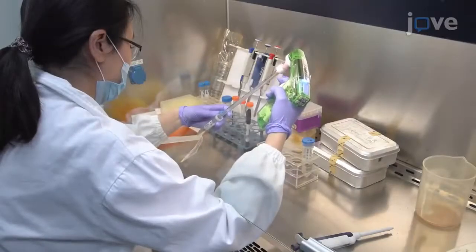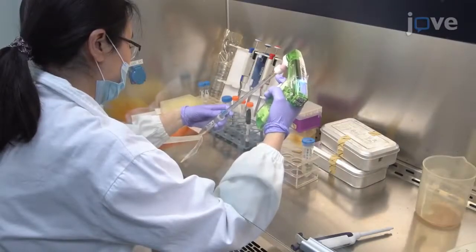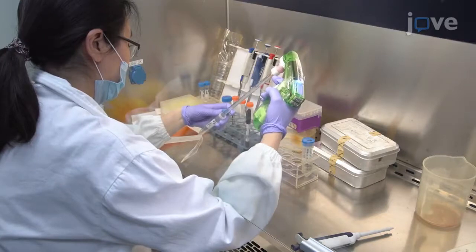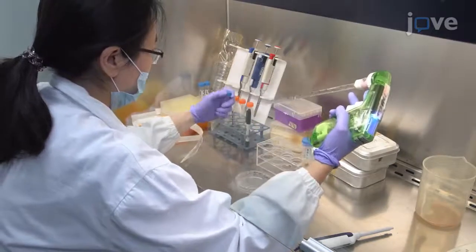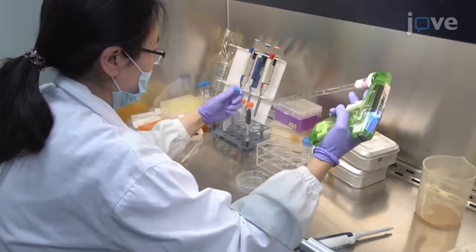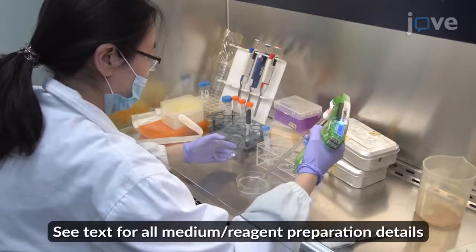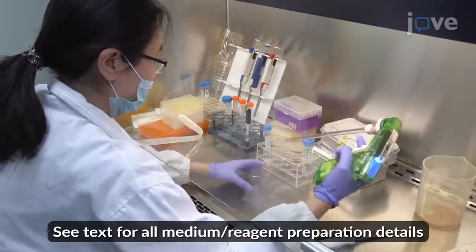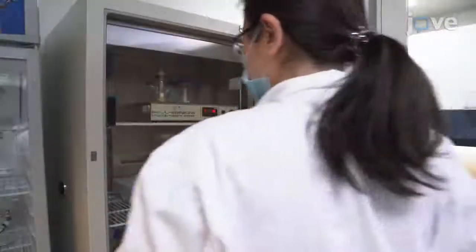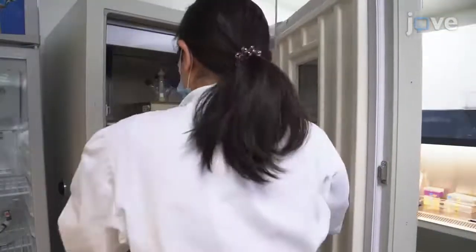Begin by growing 1 x 10⁷ viable S2 star cells per milliliter as a loose, semi-adherent monolayer in a 10 cm cell culture dish with 10 mL of complete Schneider's Drosophila medium, without additional carbon dioxide, at 25°C for 1 hour.